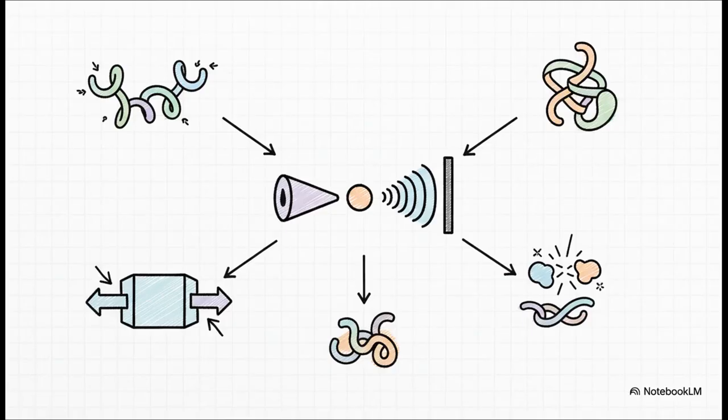With SAXS, we can design brand new polymers, we can watch materials stretch and even break in real time, we can study how complex things like proteins fold themselves into their perfect functional shapes. You can even watch chemical reactions as they're happening. It's all leading to new and improved materials for basically everything, from airplanes to our electronics.